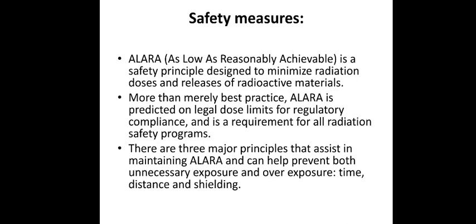Okay. The next component of this session is identifying safety measures, because radioactive elements, we know, most of them are ionizing radiations. They might cause mutations, they might make our cells cancerous. So it's always important to take safety measures. One of the basic principles is ALARA, that means as low as reasonably achievable.